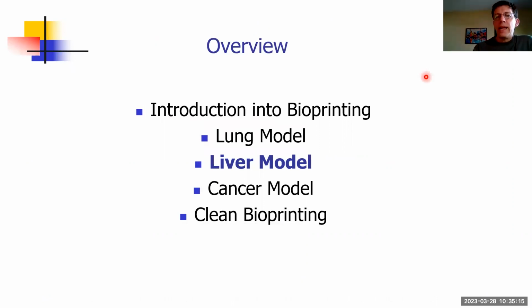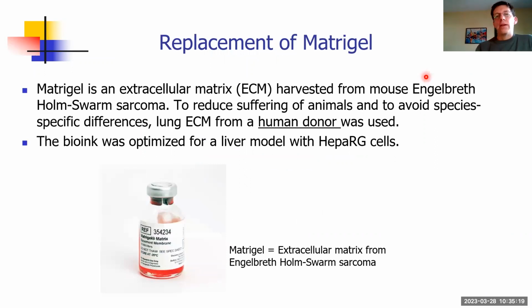Okay, let me now switch to our liver model. And I will here already briefly introduce our efforts to replace animal components in non-animal methodologies. I will come back to this later on again. In our initial lung model, which I showed you, we used matrigel.